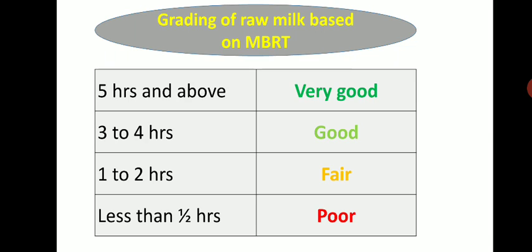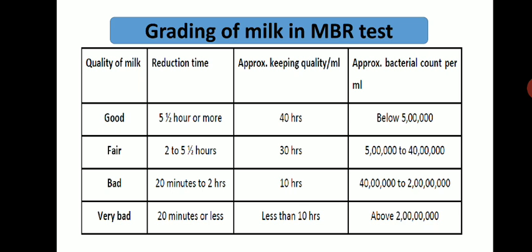So this chart shows basically the reading of raw milk based on MBRT. Very good quality milk is considered after decolorization after 5 hours and above. So, the grading of milk in the MBRT test.